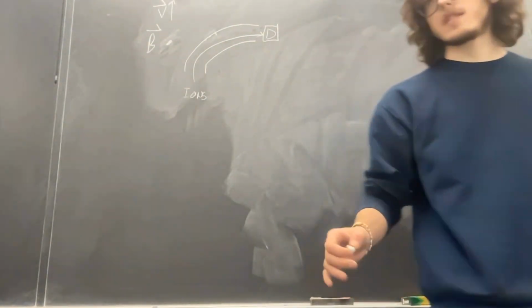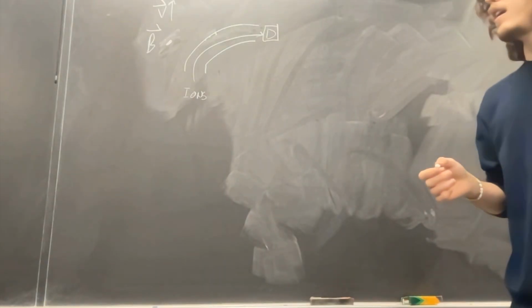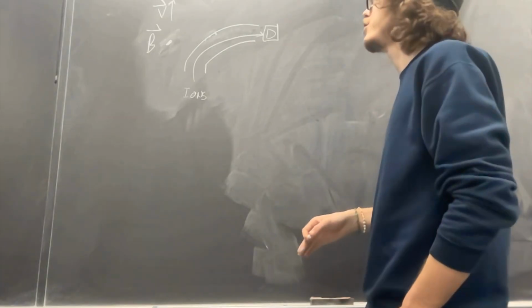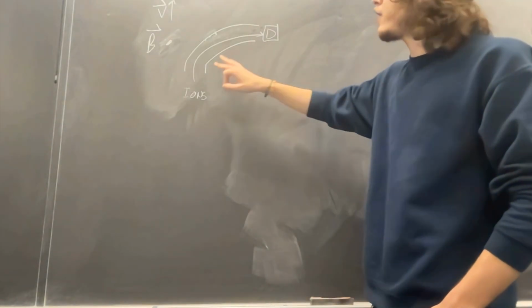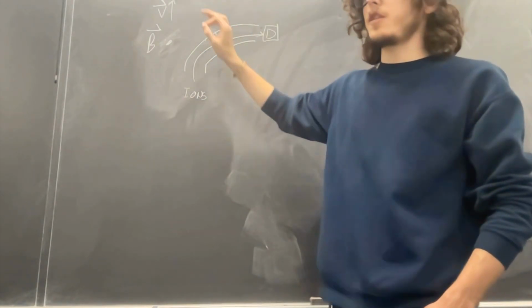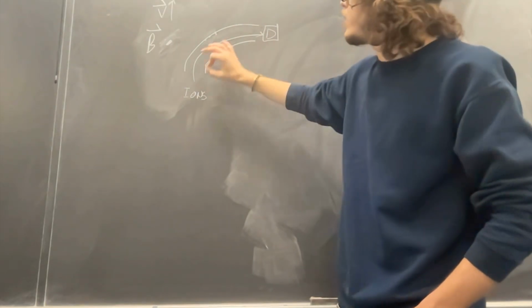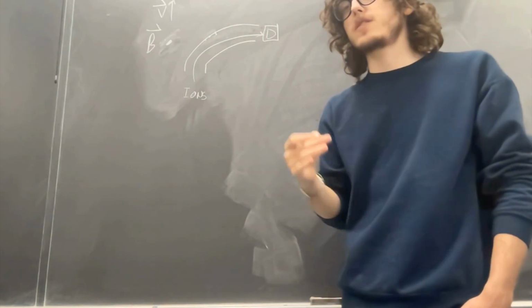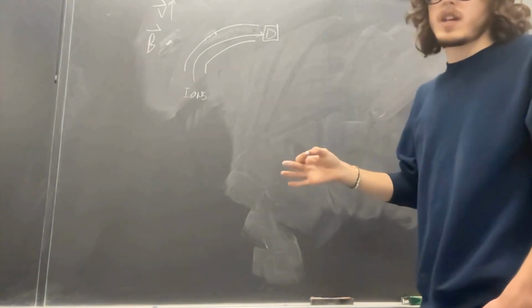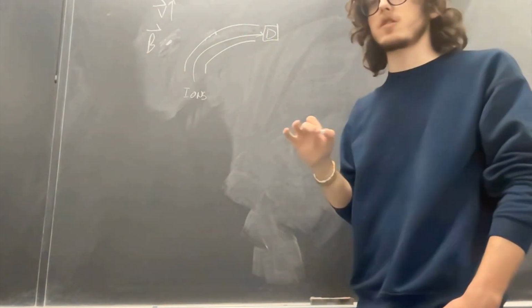Hi guys, in this video we're going to be talking about double focusing mass analyzers. If you remember from my previous video or from your knowledge, a magnetic analyzer takes the ions and uses a magnetic field, using the velocity to centripetally force the molecule into this path. If the ion's mass is just right, because we know K equals 1/2 mv squared, the just right ions will hit the detector.